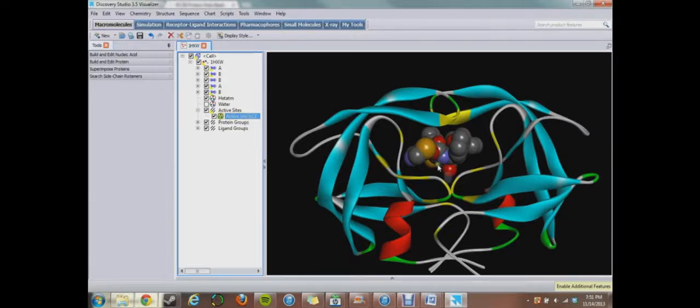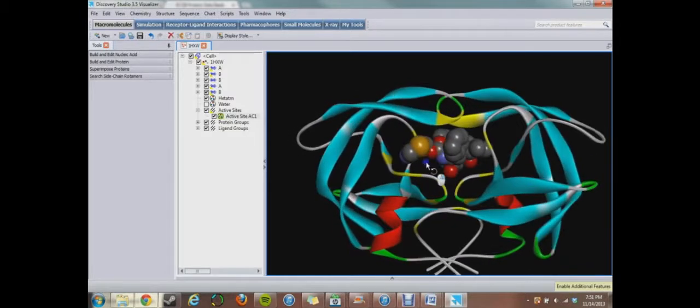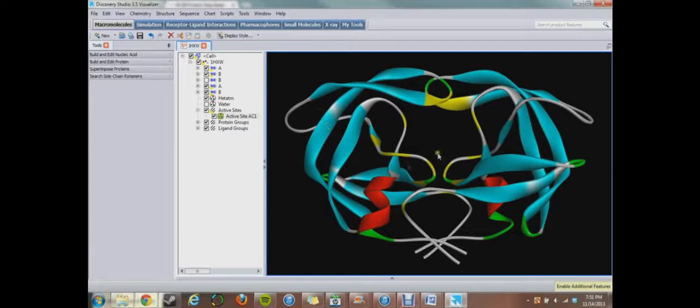I don't want you guys to assume that. Anything you write, you need to prove. For example, one time, when I look at this protein, I kind of see a dog face. I see the nose here, I see whiskers here, I just kind of see eyes here and ears here. Now I know that's stupid, but whatever.